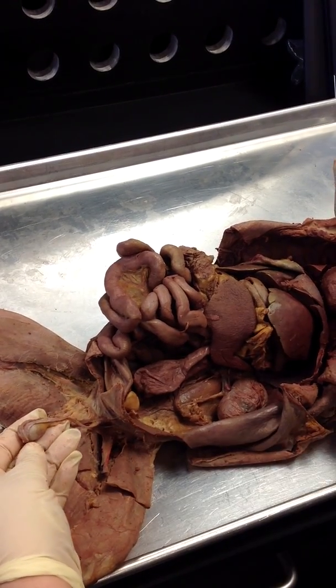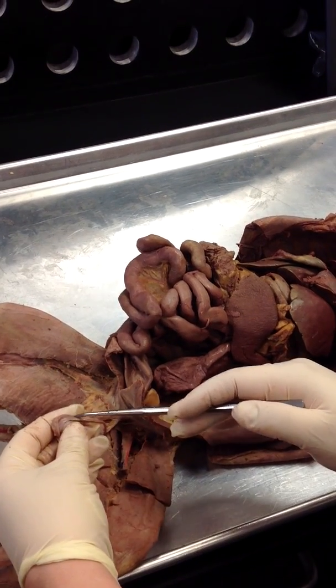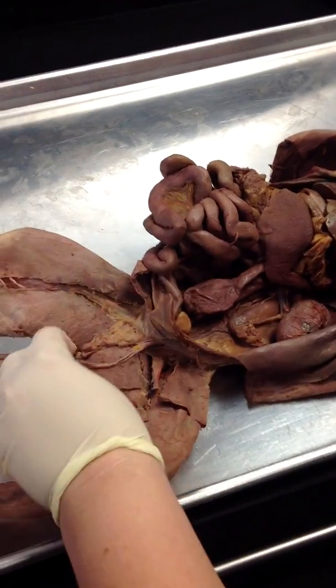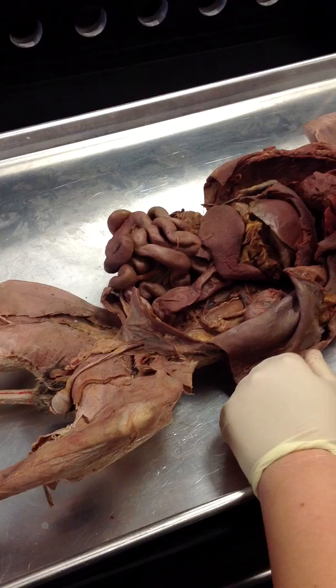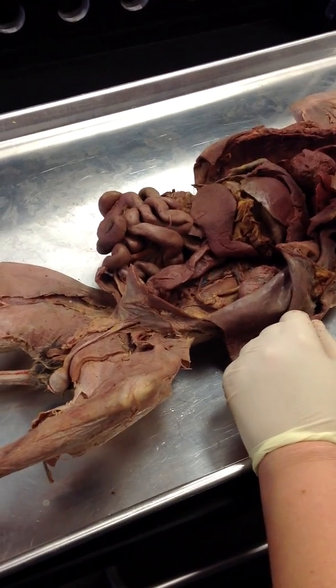Okay? He has very good epididymis. See how obvious that is? That's a nice epididymis. Should we write that on our notes? You should, on your little love note to your cat. He has the most beautiful epididymis of all time. When we lay him to rest. There you go, nice epididymis. What's his name? Binks.